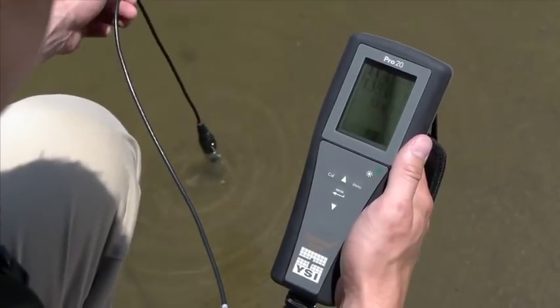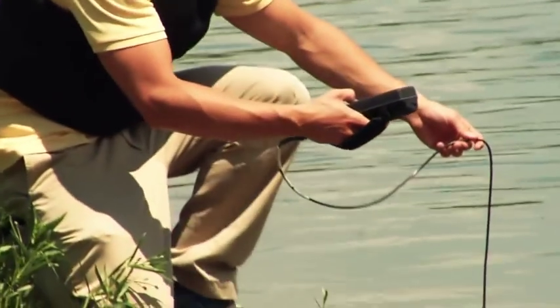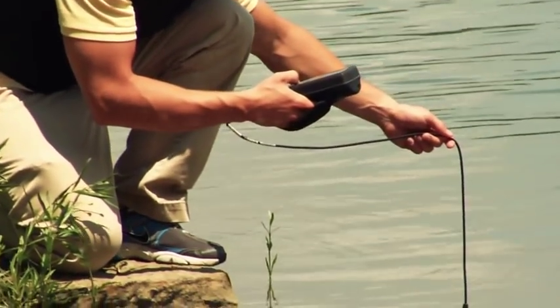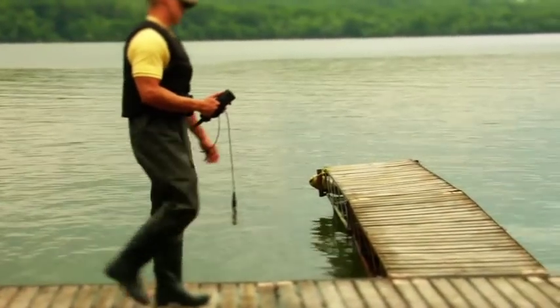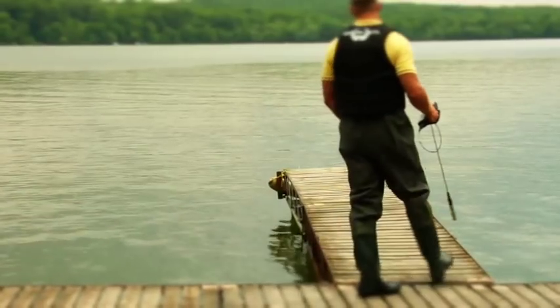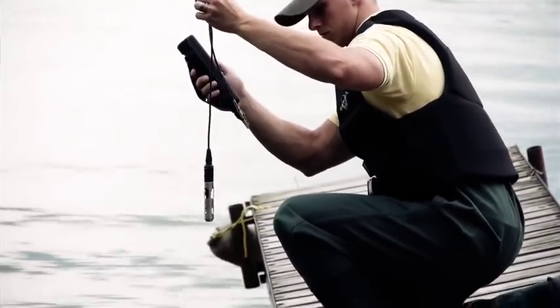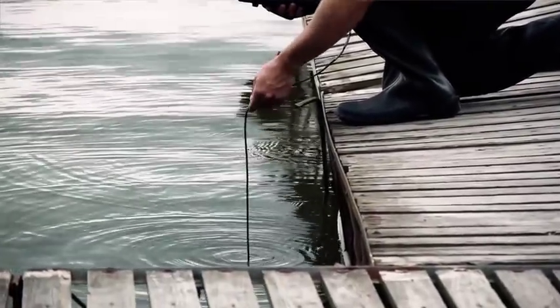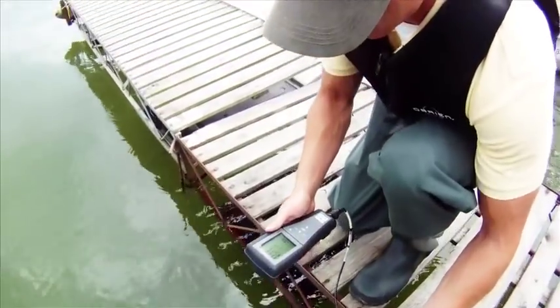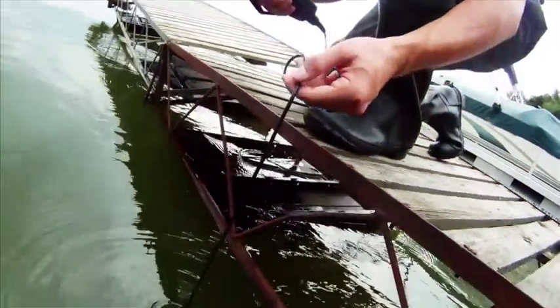The Pro 20 has the fastest response times with the Polar Graphic or Galvanic Dissolved Oxygen sensors, allowing you to complete your sampling routine quickly. The long life of the Polar Graphic sensor saves time and money and reduces your overall cost, while the Galvanic sensor enables you to start sampling immediately without a warm-up period. Regardless of which sensor you use in the field, you'll get the accurate, quality data that you've come to expect from YSI.